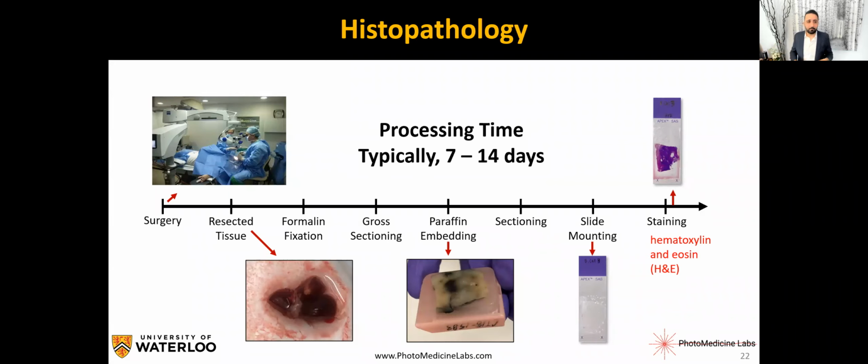It's important for us to understand the workflow before we jump in a little deeper. The idea is, if there is a tumor that must be removed, the doctor has to make sure they remove the entire cancerous tissue, down to even the last cell, because if you leave any cancerous cells behind, the tumor can come back.